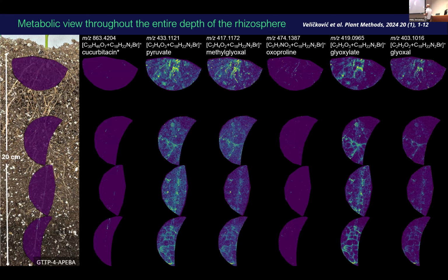And then we have, in the first image, a secondary metabolite, cucurbitacin, I think it's pronounced, and it is actually localized exactly on the epidermis of the root. It doesn't exude into the surrounding material, the surrounding soil and medium.